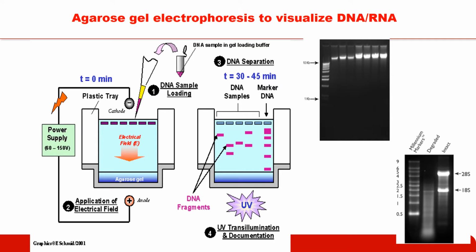This slide represents a nice diagram of the entire electrophoretic process. DNA is clear after extraction, therefore it won't be able to be viewed once loaded into the wells. It is mixed with a sample loading dye, which gives it a purplish color. This dye also gives the DNA density so that it doesn't float when it's under the buffer. It basically sinks to the bottom of this gel. This agarose gel is made from seaweed and it's a nice tightly packed gel-like matrix.